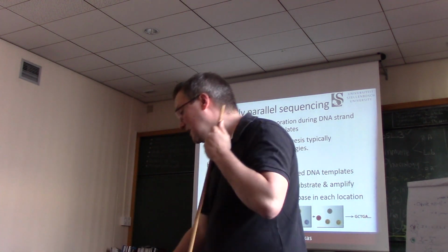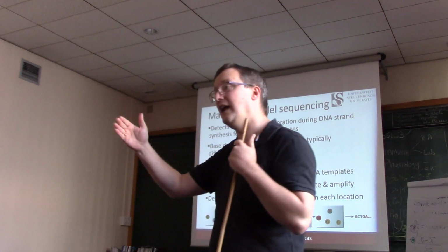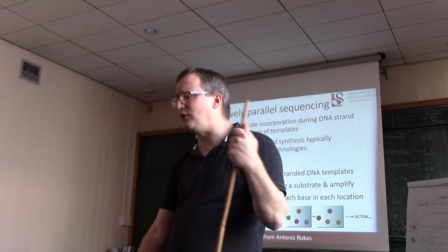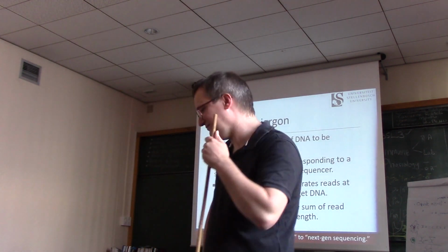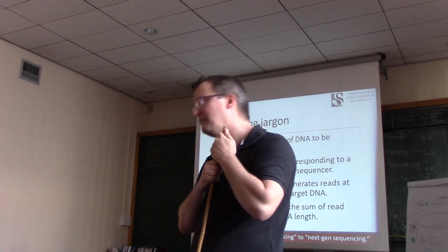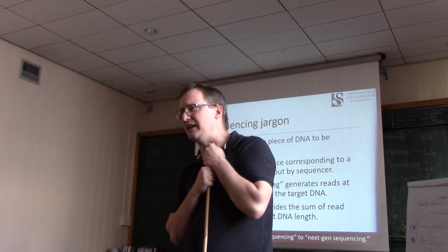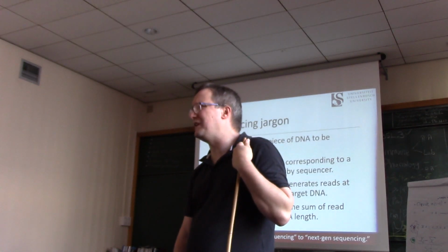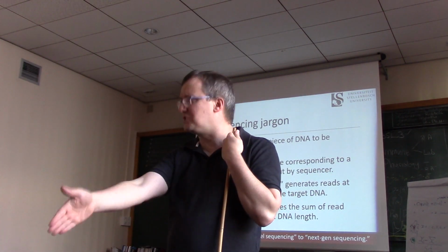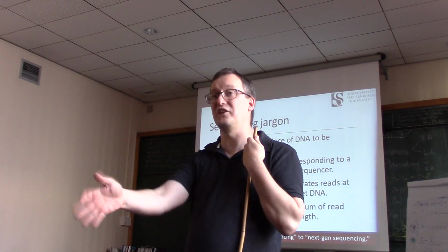Okay, so that's the difference then between Sanger sequencing, the old dye terminator technology, and massively parallel sequencing or next-gen sequencing. You will not be punished for calling it next-gen sequencing. Okay, there are lots and lots of bits of jargon that come along in this world, and before I just lurch ahead, I want to be sure that we talk about some of them. One of these is template. We frequently refer to as a template the sequence that we're inputting. What is the strand that we're putting at a particular location on this bed to have complementary sequences built for? Okay, so the template is the thing that we're going to sequence.